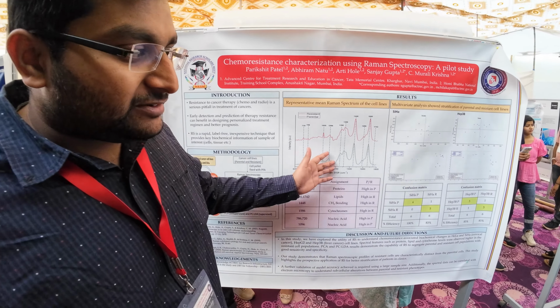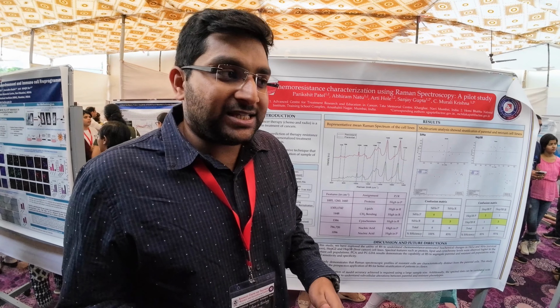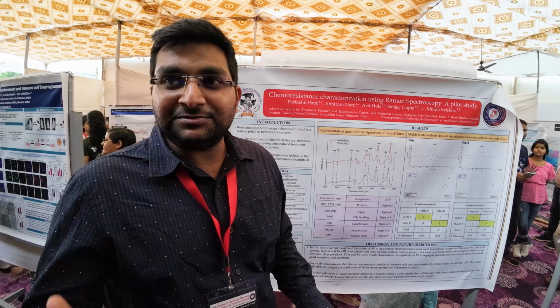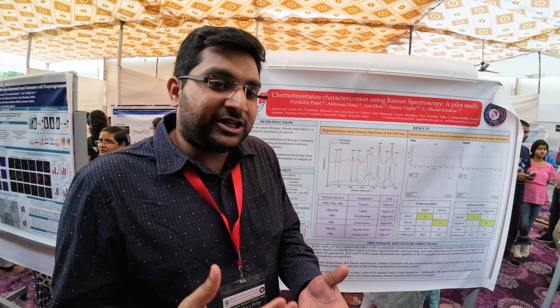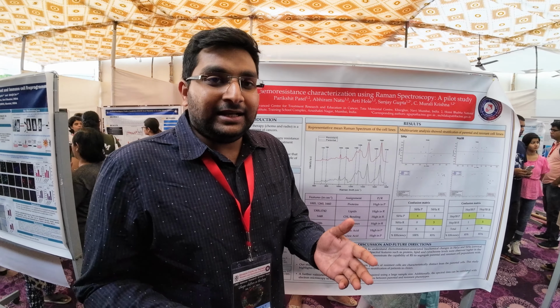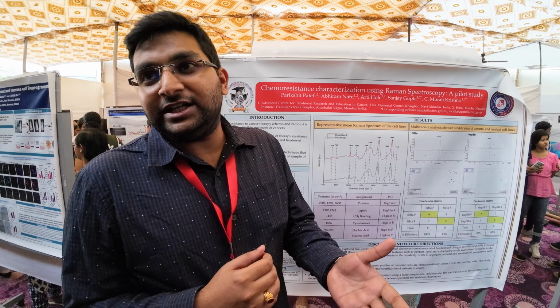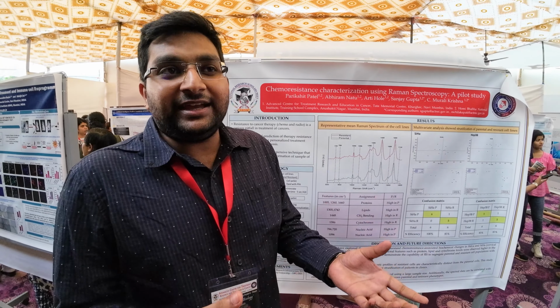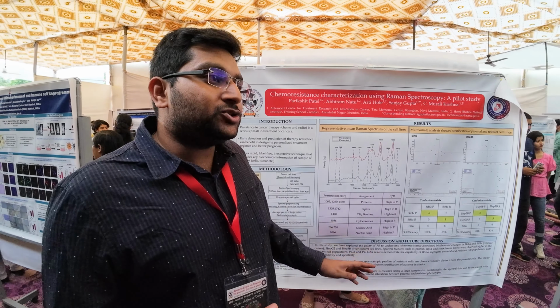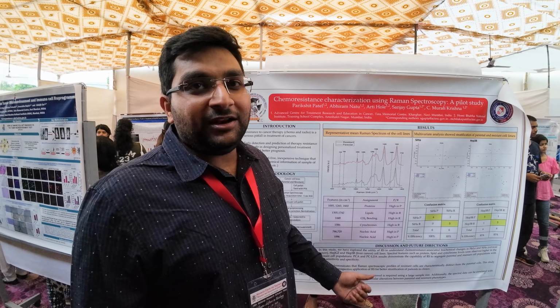Further validation of this is required using a larger sample size, and we also need to understand, using electron microscopy, what the subcellular changes are and whether those subcellular changes are also overlapping in their occurrence. Like in all the resistant cell lines, we want to find out whether there are some mitochondria associated changes or something else. And if we can get this kind of understanding, we can develop models in future with that, and that can be helpful in clinics.